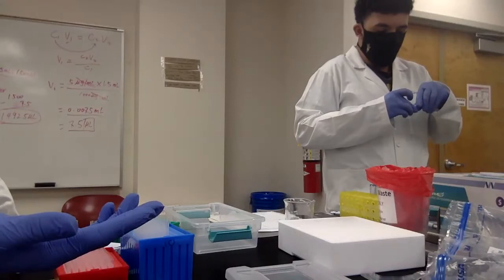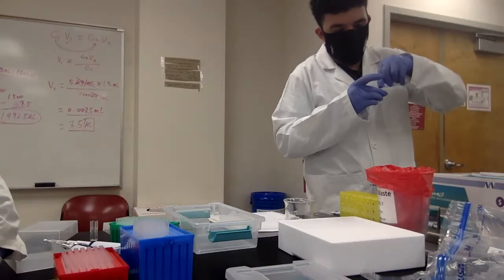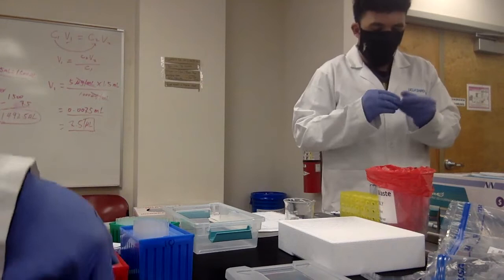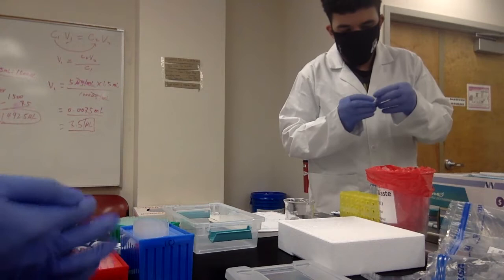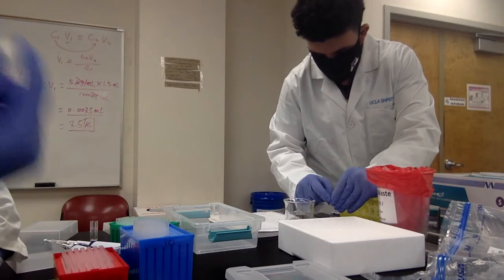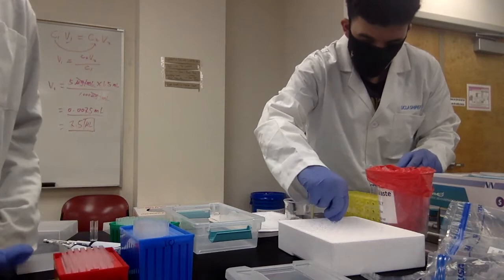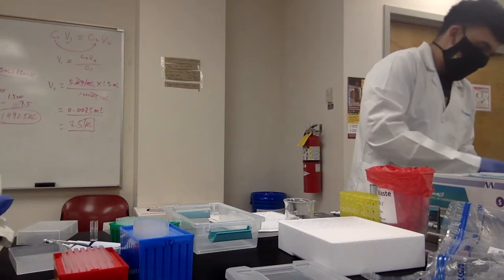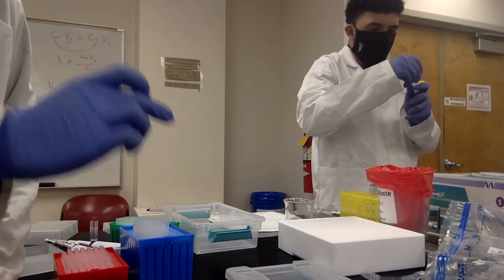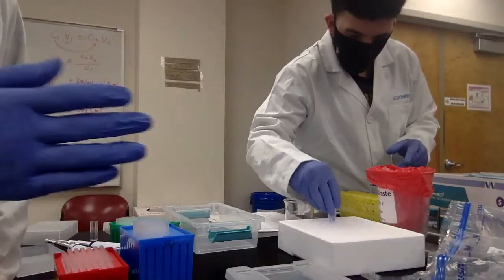Because for the Beer-Lambert law, the equation is A equals extinction coefficient times concentration times path length. In that case, the absorbance is only from the molecule, the stock A molecule in a solution. But in the solution, we not only have the stock A molecule, we also have water molecules and ions in the water, such as cations like magnesium. So that's why we need a blank sample, which is the cuvette with water. We will measure the absorbance from the blank and subtract this number from the rest of your absorbance. That result will give you the actual absorbance from your stock A molecule.